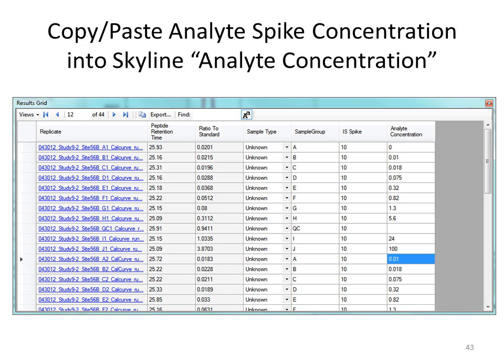So you see the system suitability in there? That was my mistake. If you go down, just keep that value for analyte concentration blank for that system suitability, because that shouldn't be in there, and then move all the others down.